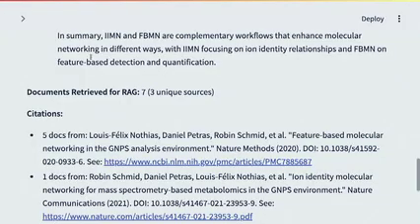Okay. So this is just an overview of what can be done, and my key message here is that the knowledge base is the key in order to deploy such AI capability, because the documents have to be in the public domain. So any YouTube recording, like a workshop that is on the web, can be used for that. Similarly, preprints.